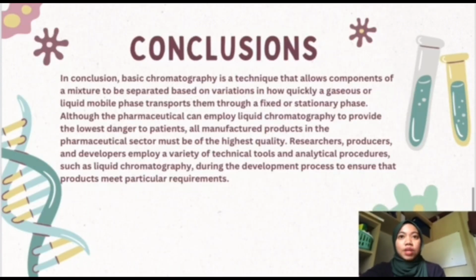In conclusion, basic chromatography is a technique that allows components of a mixture to be separated based on the variation in how quickly a gaseous or liquid mobile phase transports them through the fixed or stationary phase.